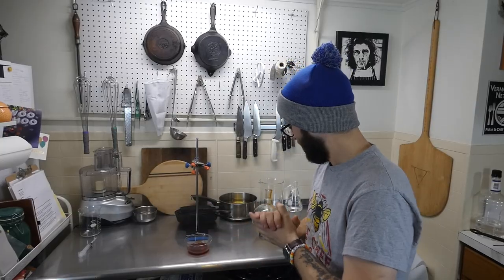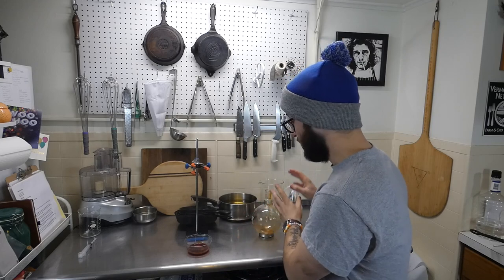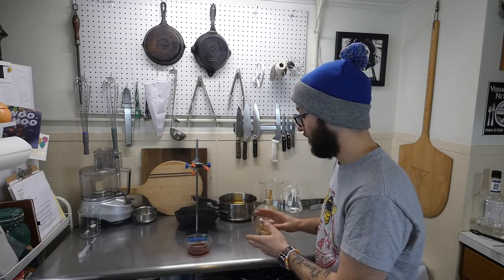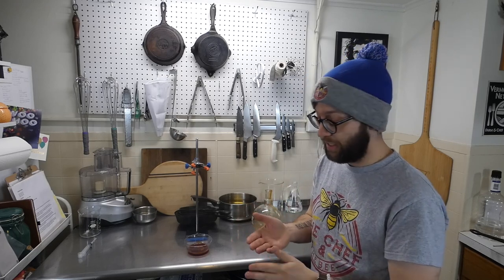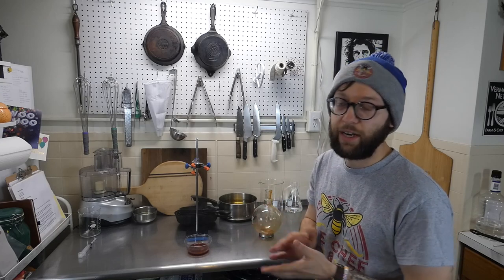Before I did that, I completely forgot. Definitely wear gloves when you're dealing with this because the capsaicin is highly concentrated. You get it on your skin, it's going to burn your skin. You rub your face, you rub your genitals, it's not going to be a great day for you. So wear gloves, don't be like me.